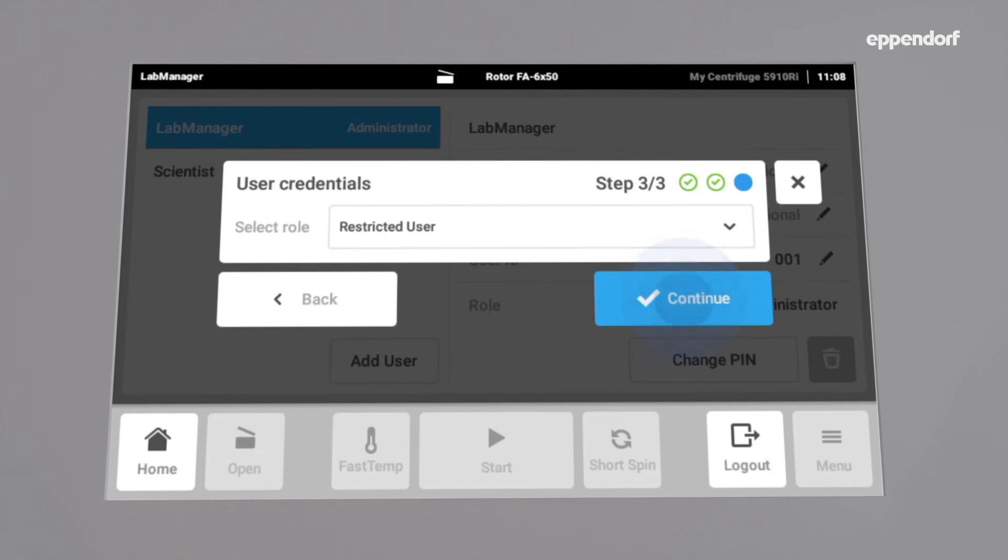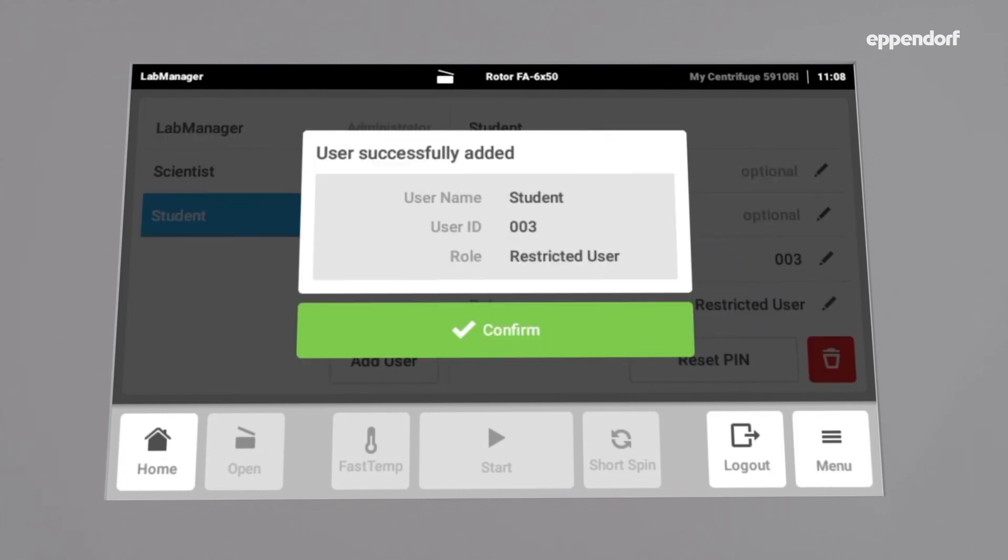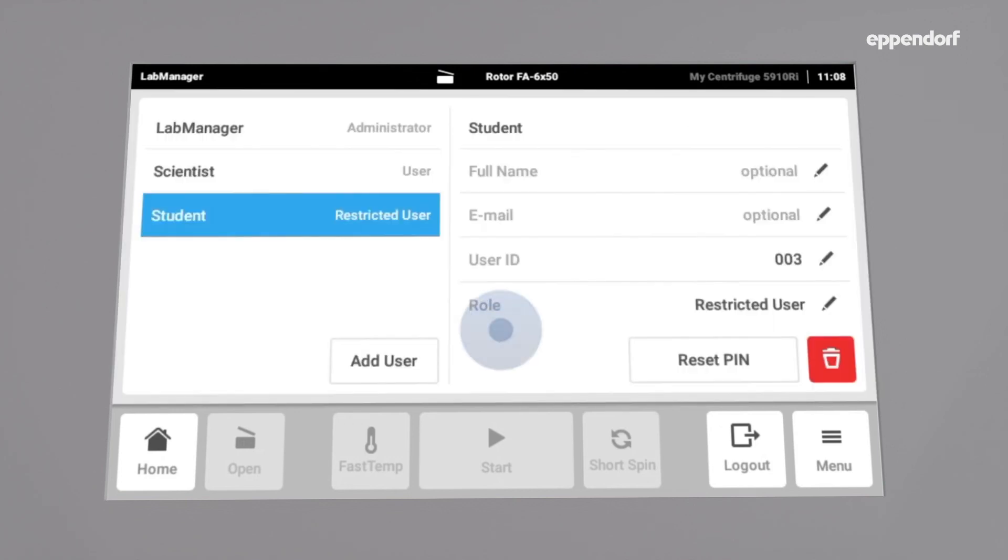By tapping Continue, the new user is successfully added and can now be used. The user management of Centrifuge 5910 RI can store up to 999 different users, and is therefore suitable for laboratories with a multiplicity of users.